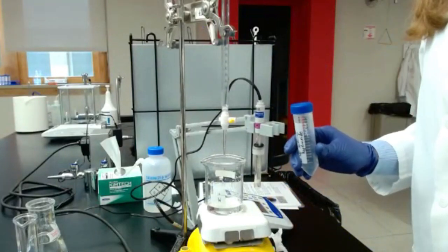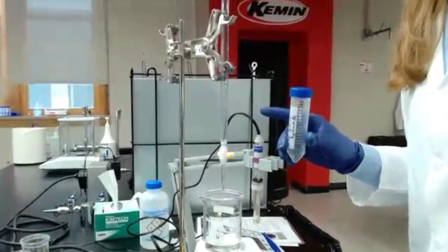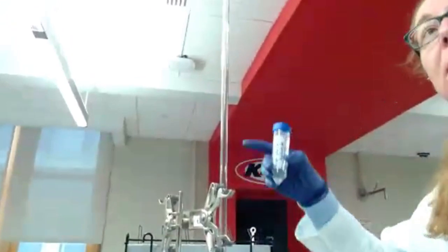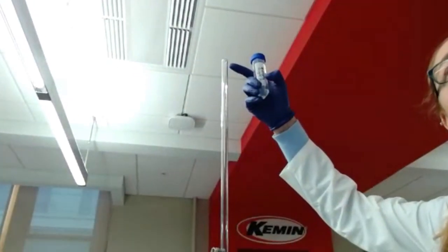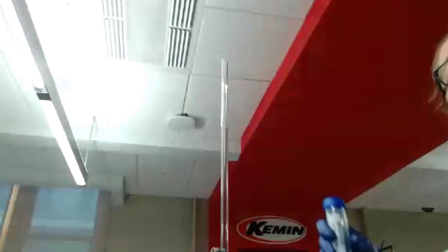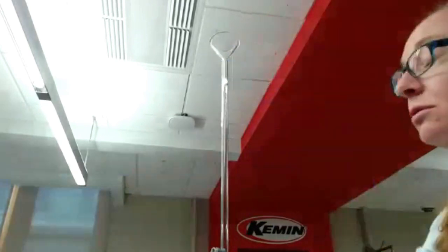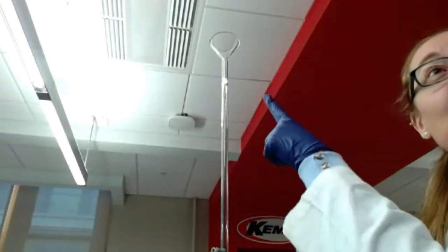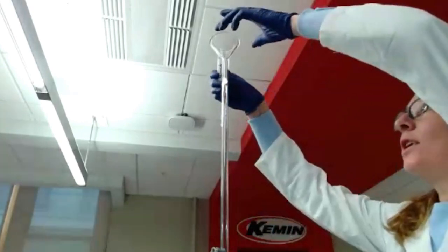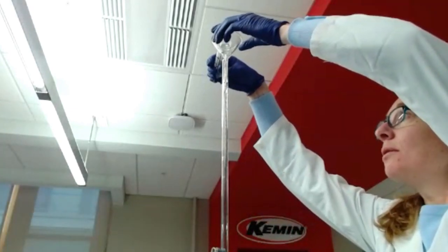And then here I'm using, as I said, a 50 milliliter burette, which is pretty big, pretty tall, right? To avoid spilling solution everywhere, you might need to use a funnel, unless you are really a pro. I'm not really a pro, so I'm going to use a funnel. I'm going to just transfer almost all the solution.